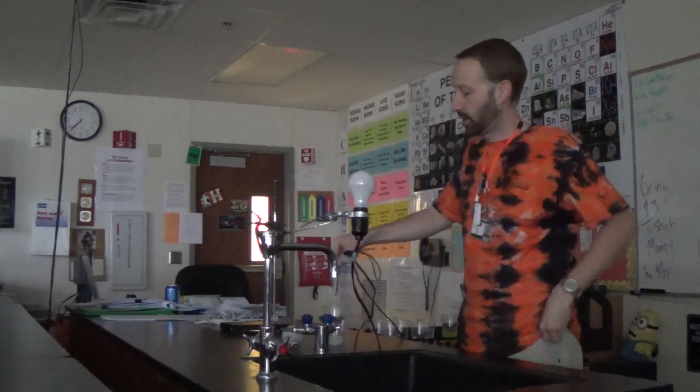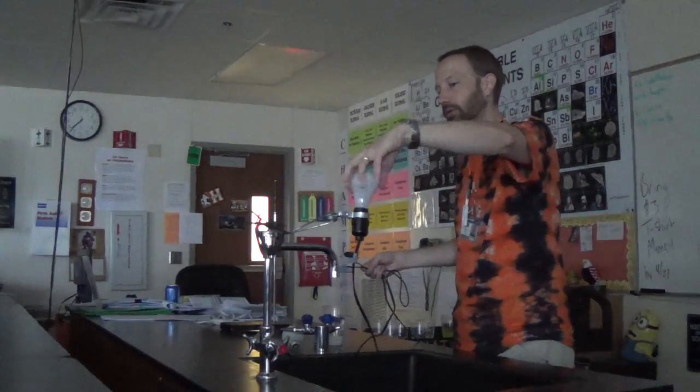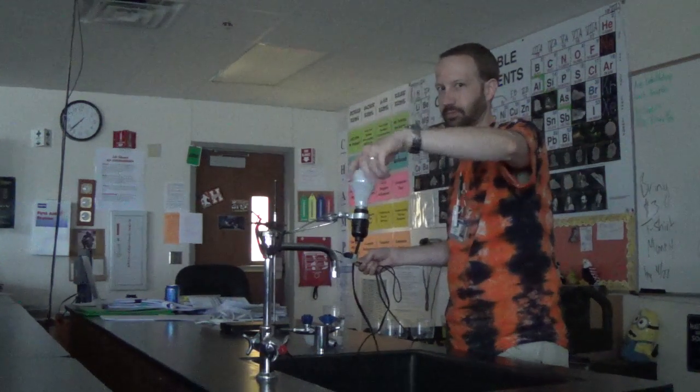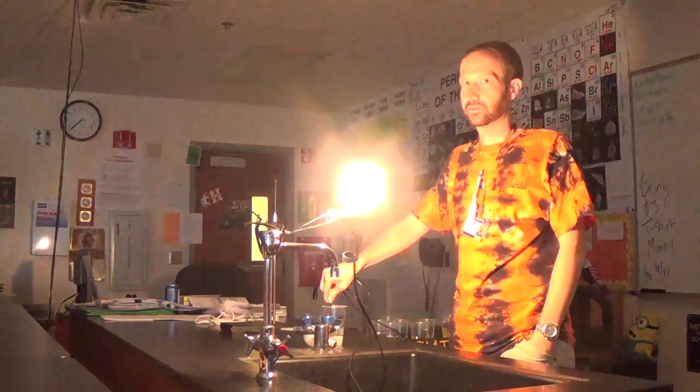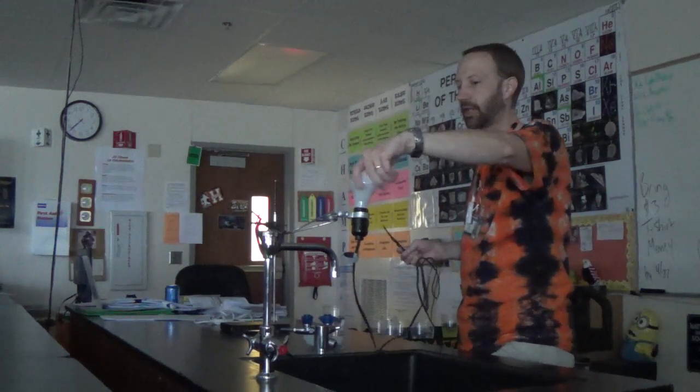Okay, now that's the 34 watt bulb. Let's try the 100. What kind of electrolyte? Strong. Strong electrolyte. So if you were hanging out in a bathtub full of sea salt or Epsom salt or bath salts or whatever else you might want to add to your bathtub and someone dropped the hairdryer in, you are in trouble. It's going to go bad quickly.